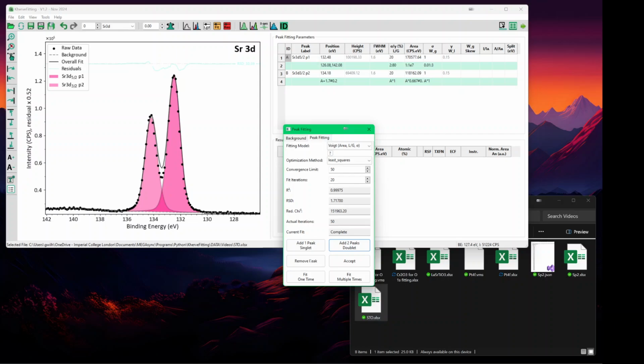Yeah, for now. And then if I fit this, this is the ratio, the concentration between Lorentzian and Gaussian. In this case, we are down there now. And so we are looking at the width of the Gaussian and the width of the Lorentzian, because when you work with the Voigt function, you cannot work with the overall full width. You have to work with the width of the Gaussian and the width of the Lorentzian. So in this case, I have to be able to work with the shape of the peak.